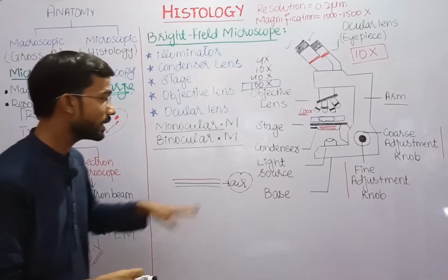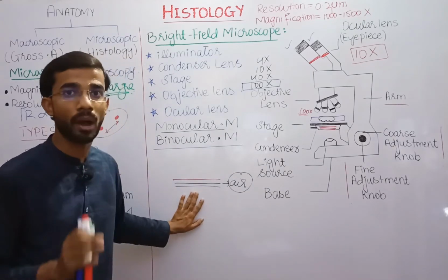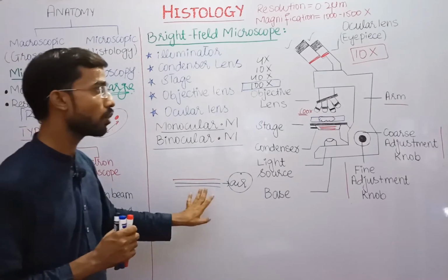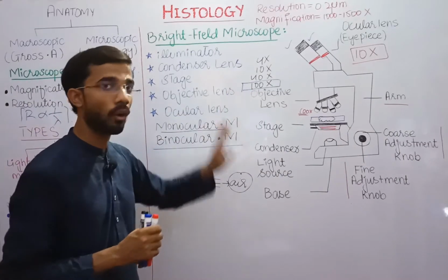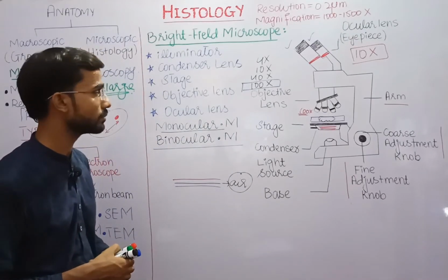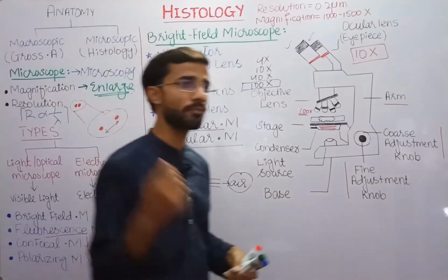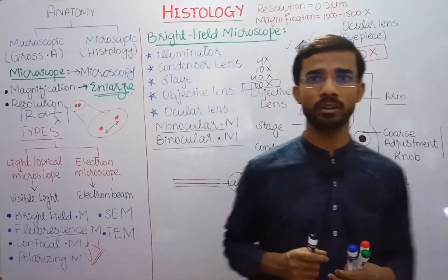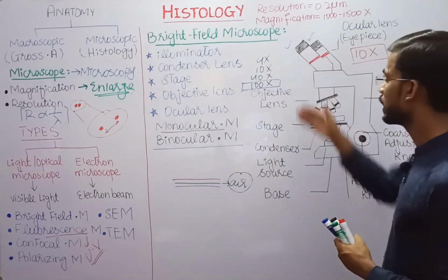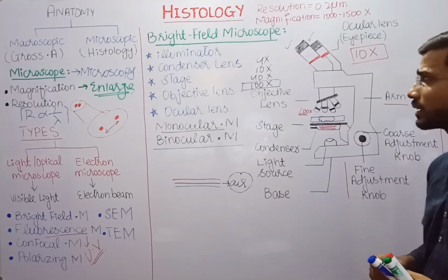So due to the absence of air, the resolving power of the microscope increases. So we use oil in the 100x field, right?